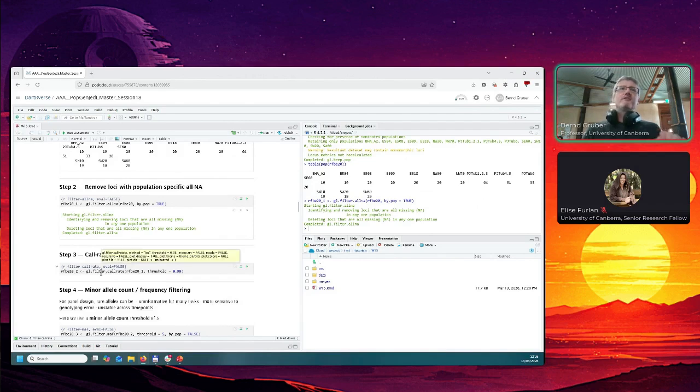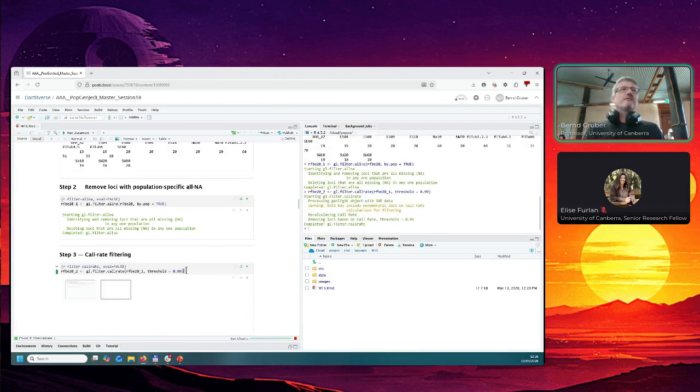Okay. Next thing, we want to have high quality SNPs. So missing data overall is also key. Think about it, you only want to have maybe 100 SNPs, so you can filter hard. You want to have high quality SNPs, so nothing stops you from doing a call rate threshold of 0.99. You could even do 1, and you would still probably have hundreds of SNPs to choose from.